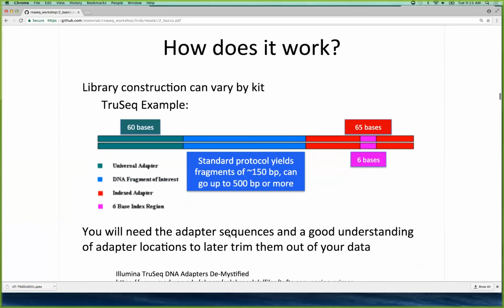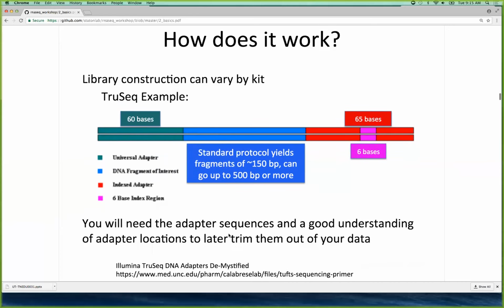Okay, so it's probably a good idea if you haven't to learn a little bit about how the Illumina chemistry works. I'm not going to talk too terribly much about it, except as it kind of impacts downstream analysis, but they have some really awesome videos where they visualize what the DNA looks like and how it attaches to the little flow cell and how it bends over to do the paired end sequencing, and the videos are super fun. So I definitely encourage you to watch them.